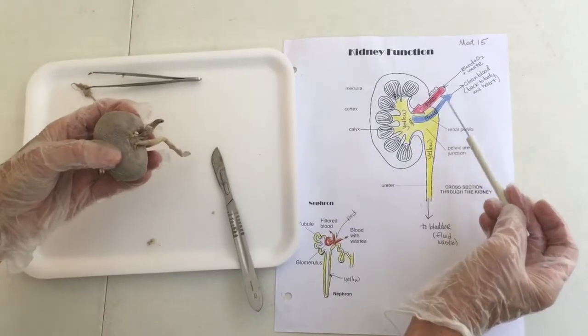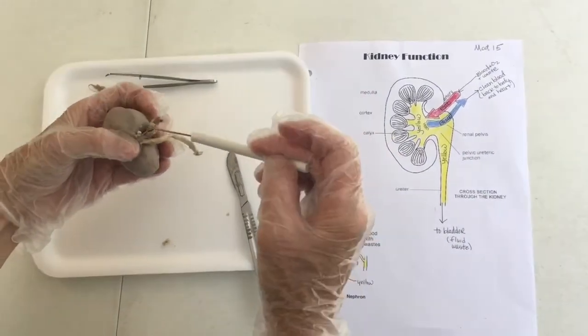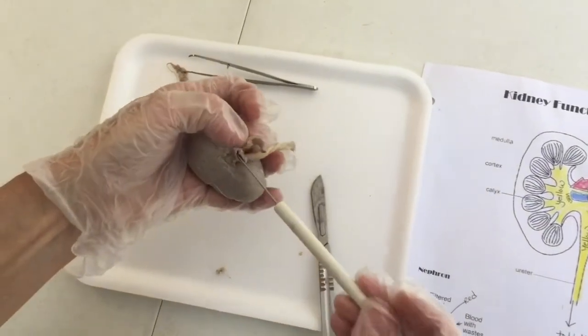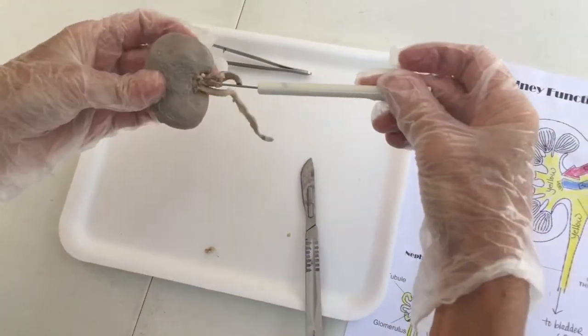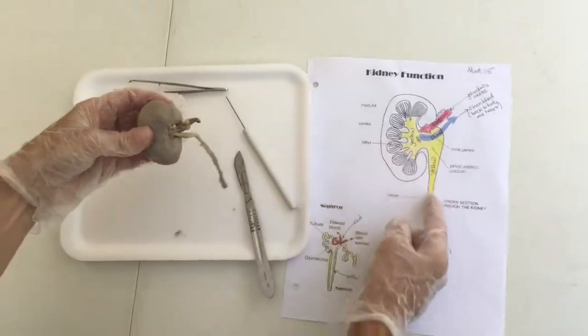The cleaner blood is going to go back out to the heart and the body, and that is this one. It's a little bit fatter. You see, it's got a nice opening there. So there is the opening. Can you see that? That is the renal vein, okay? And then again, we talked about the ureter. That's this part coming down.